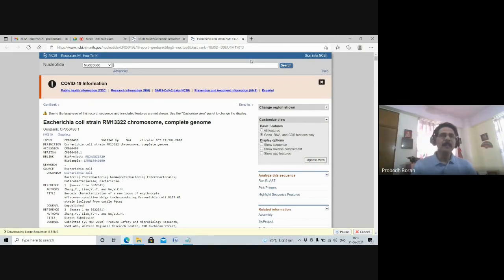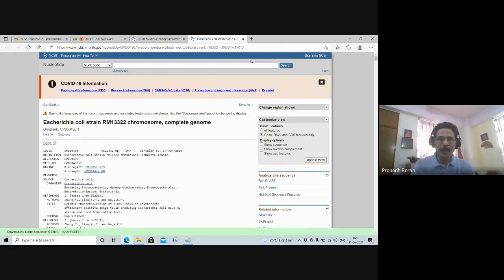If you find that some sequences in the database belonging to the same gene and same species of organism show some variability in similarity ratio, say some show 97% similarity, some show 98% similarity, then you can find out where they are dissimilar.